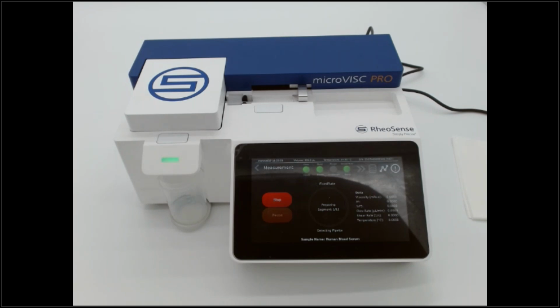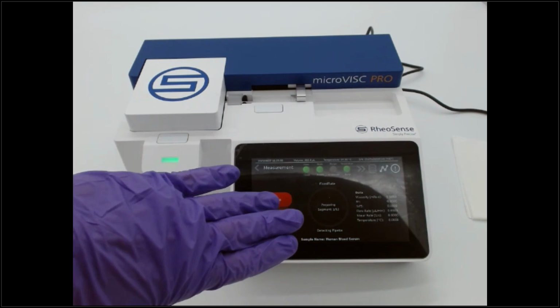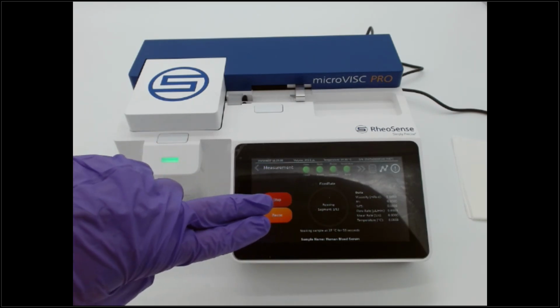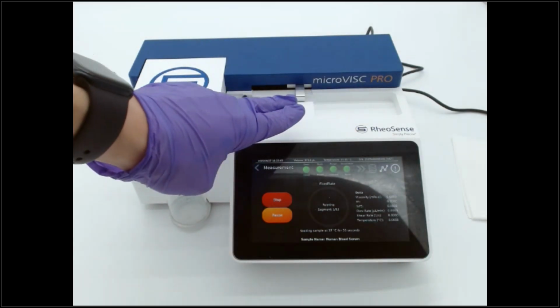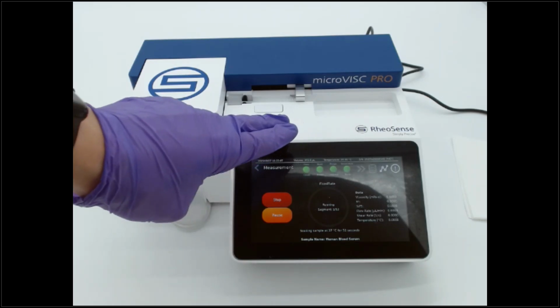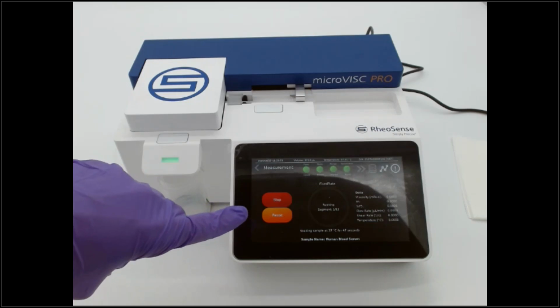So now the unit is displaying this screen here, which is where you'll be able to see the viscosity data and experiment progress. So what you just saw happen is that the pusher block was moving until it detected the pipette plunger. And then here, of course, you can stop immediately at any time or pause the measurements.